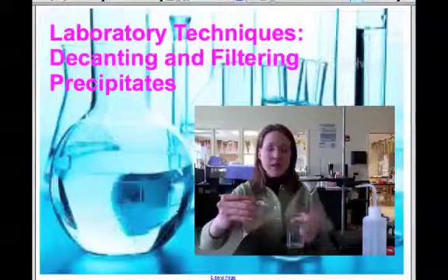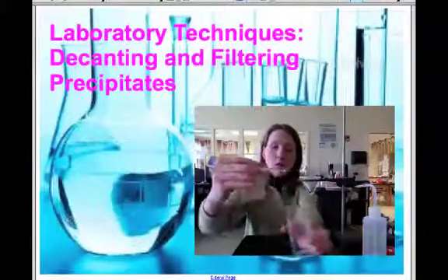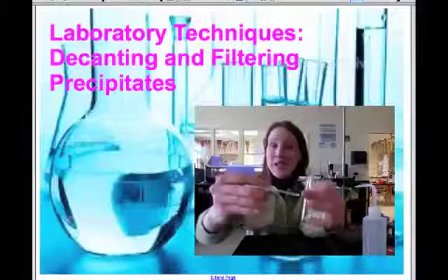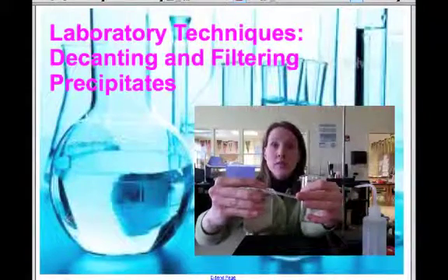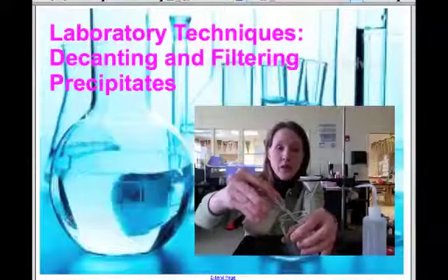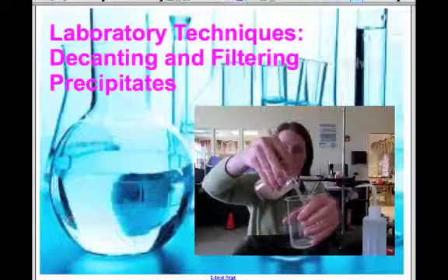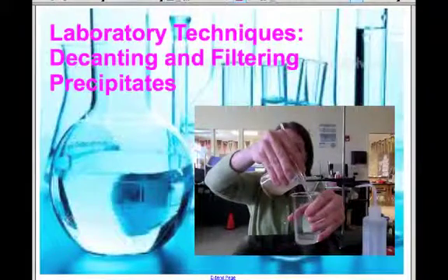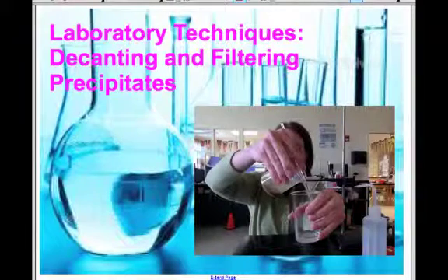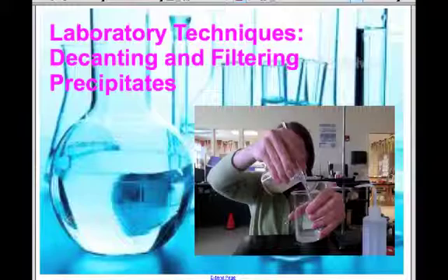Then you'll need to take a second beaker like this, and we're going to decant into it. You'll want the very tip of the glass stirring rod to touch the inside of your second beaker, and then you can begin decanting. And you'll notice that the liquid runs down the glass stirring rod, and it has a place to go. When it touches the beaker, it's going to run down the glass rather than splashing all over in the middle of it.